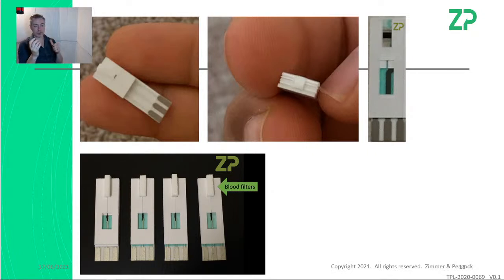So we have two configurations, two capillary sensors, one with filter, one without filter. The ones that you have are with filter. You don't have to remove anything. You just need to add the sample here, and it should wick in or capillary fill in the sample onto the sensor. We do have a bit of a video on this, and I'll have to link to that underneath below. If you have any more questions about this or get stuck on these, give me a shout.